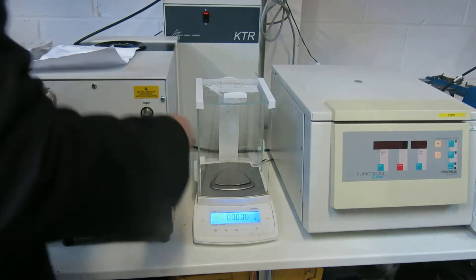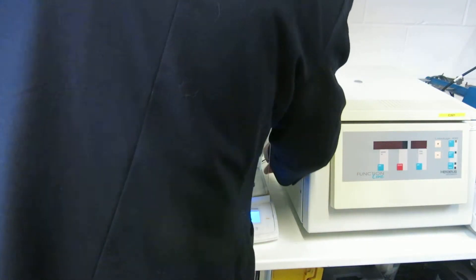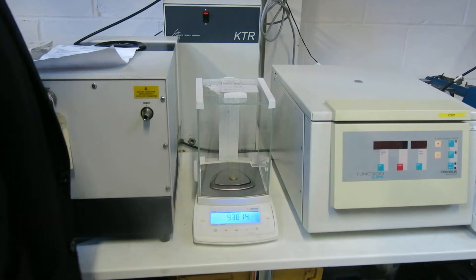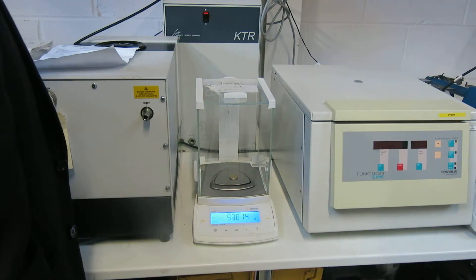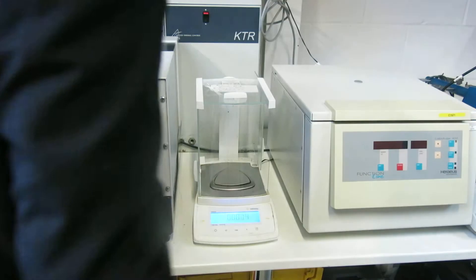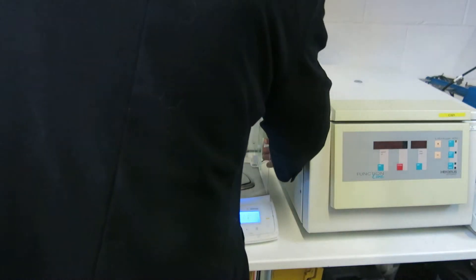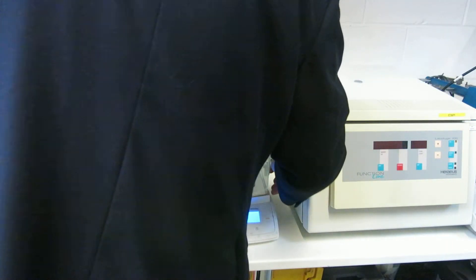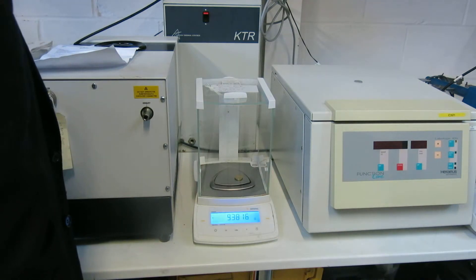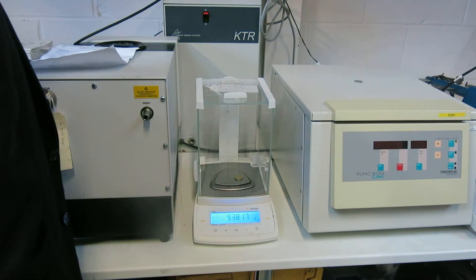So what we'll do is just do a quick test there. So we've got 9.38 grams. Get it back to zero there, as you can see. 9.38 grams — there we go.